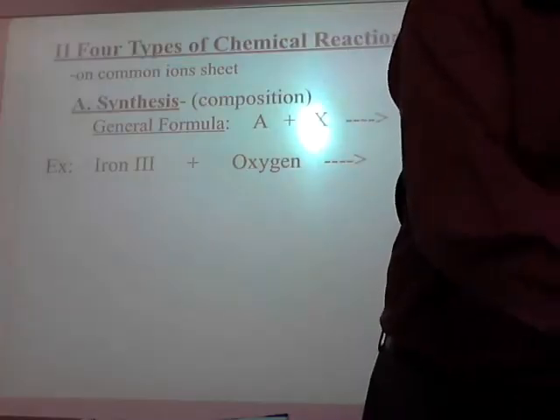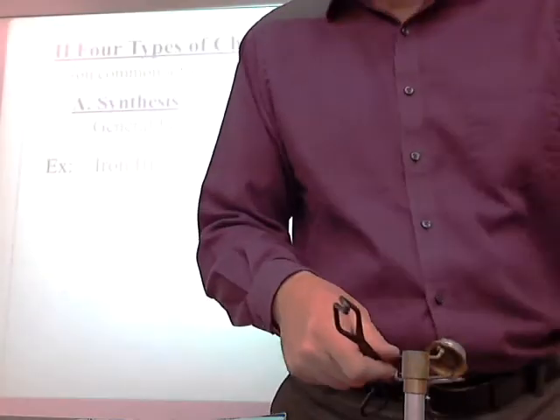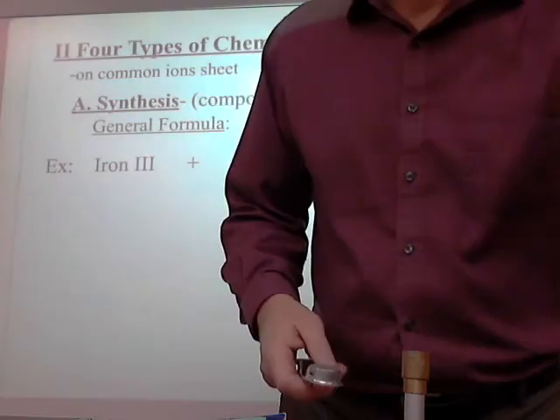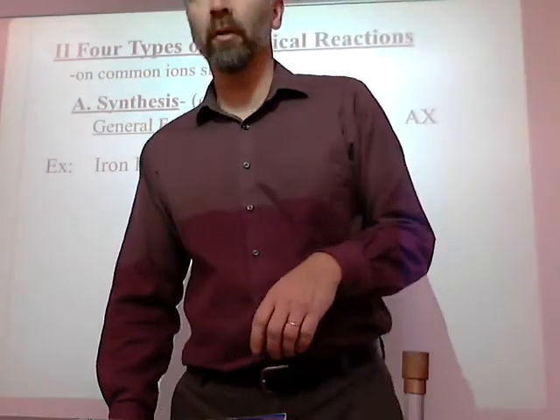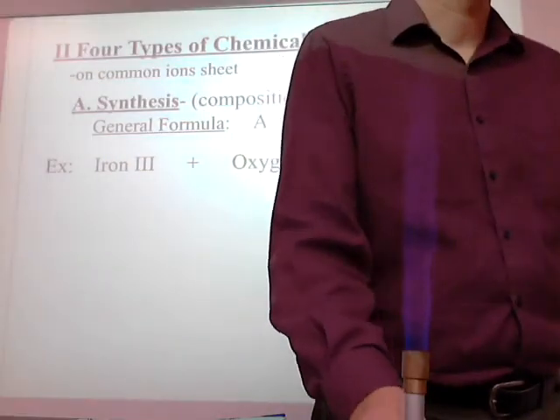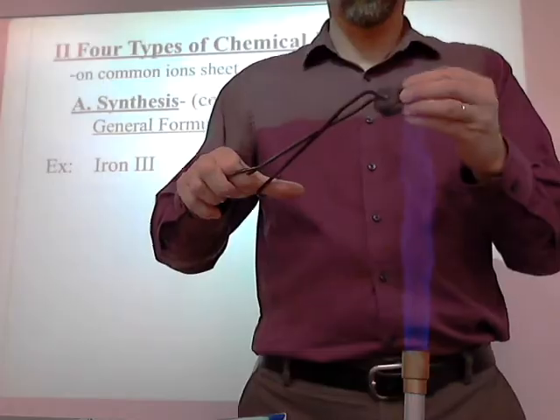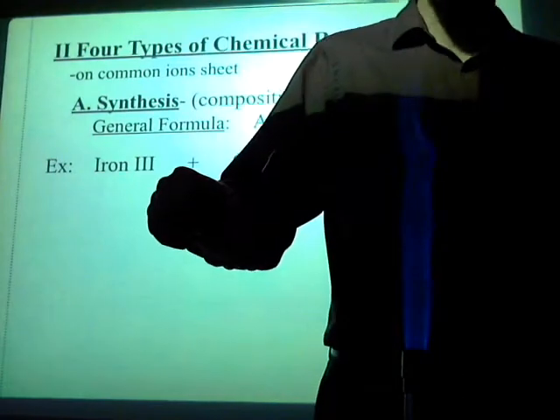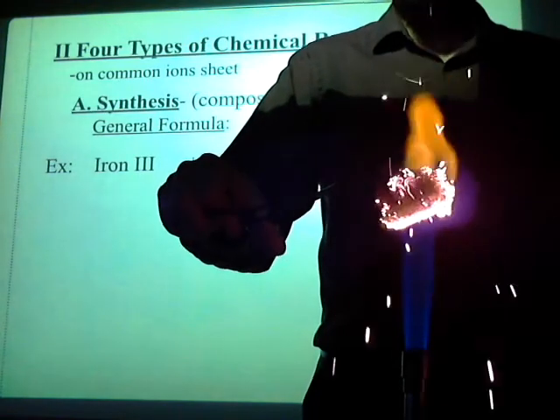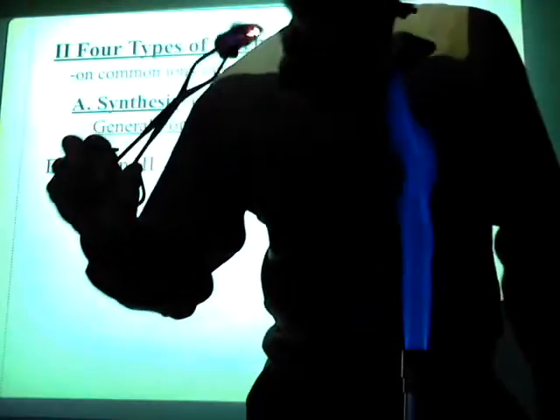Okay. Watch this. Mr. Phil's going to come in and watch this. Come here, Mr. Phil. All right. We're going to make this guy heat up. I'm going to light my burner. Watch this. All right. Turn that light off now. This is kind of cool. Okay. Watch. Ready? I bet it burns. Yeah. See it? Pretty cool, huh? That's amazing. If I blow on it, notice it burns a little bit better.